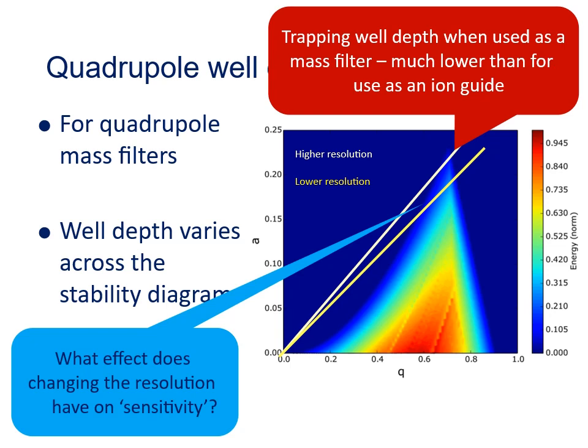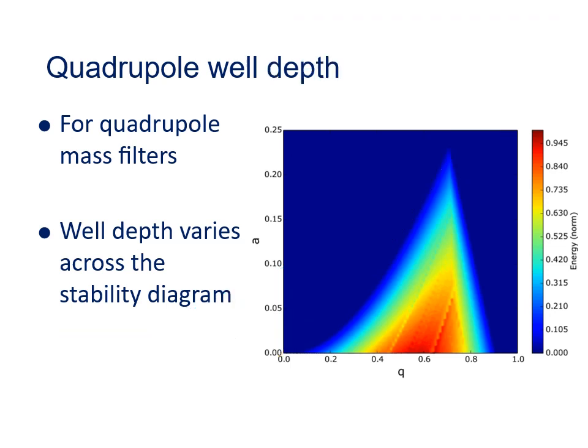The sensitivity of quadrupoles varies approximately by the square of the trapping well depth. So if you're using a quadrupole mass filter based device and you need more sensitivity, then you can trade off resolution to gain this. But if you go too far in that direction, you'll no longer have the resolution to tell apart different analytes, so it's always a compromise that you've got to consider.